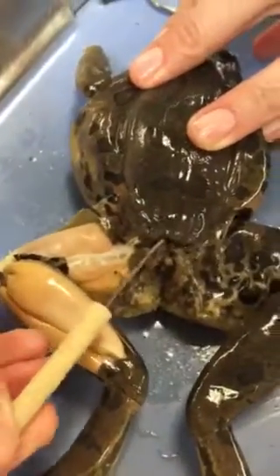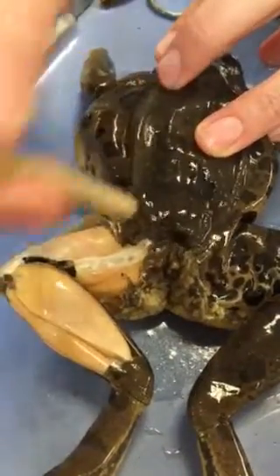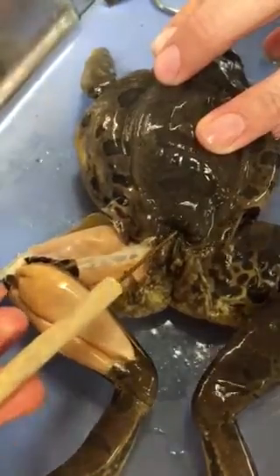Let's go ahead and do the muscles so that I don't forget. Other external features, right here, there's an opening. That's the cloacal opening. So if I have a pin right here, that's the cloacal opening.